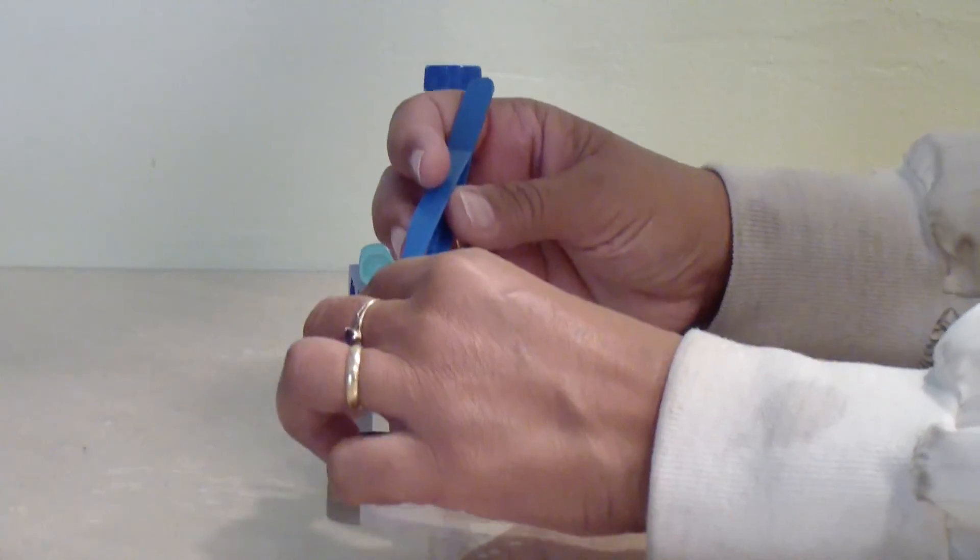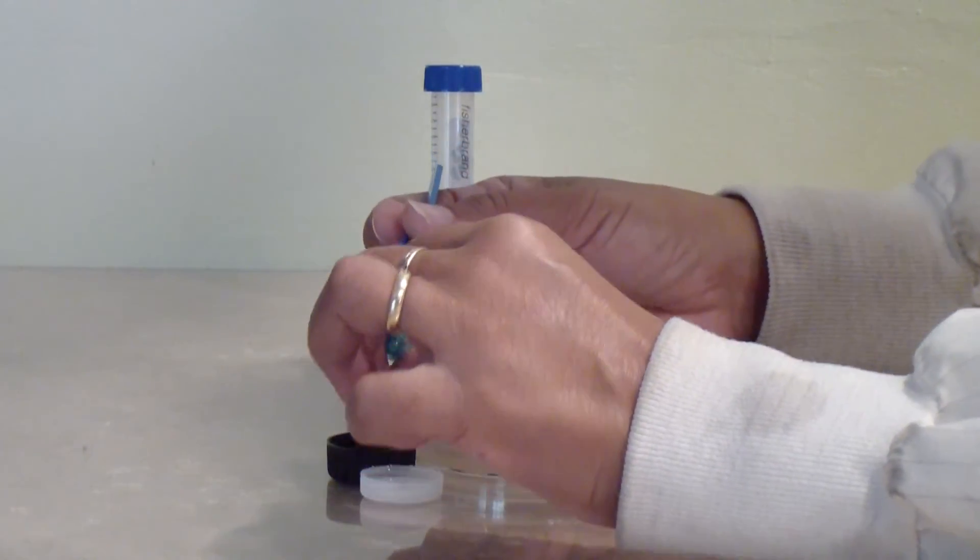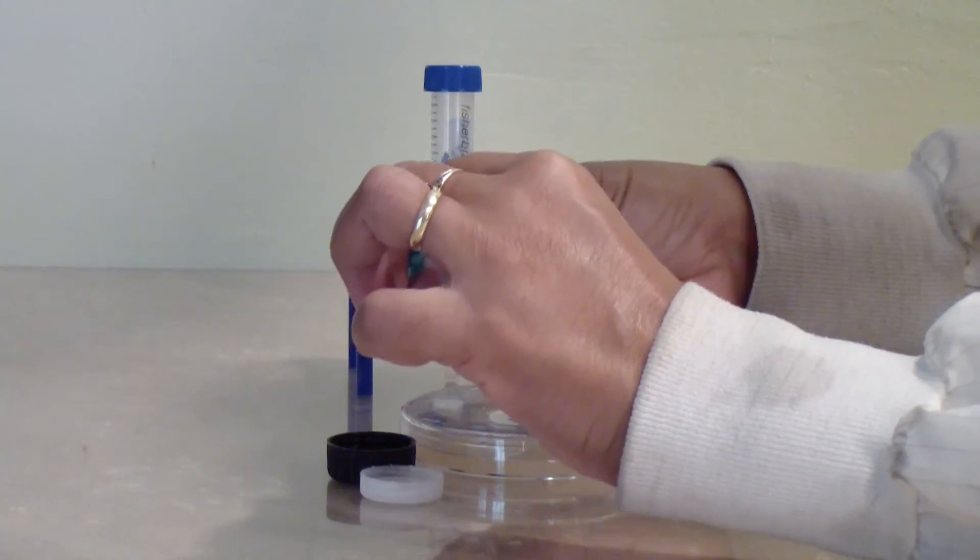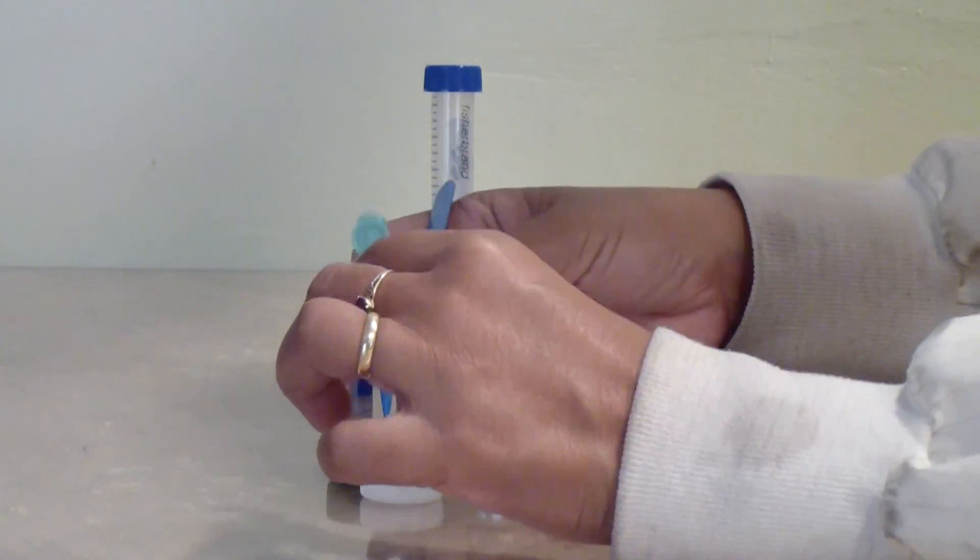With forceps, take the blank discs and dip them into the compounds you would like to test. Allow the compound to saturate the disc. Just a few seconds is usually enough.